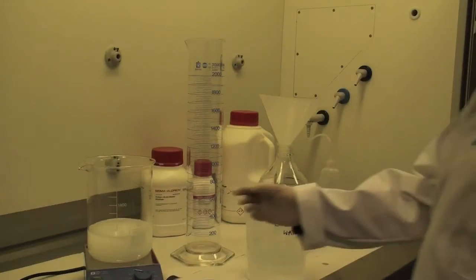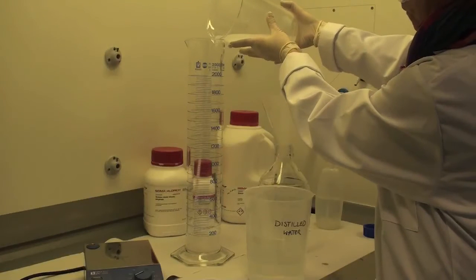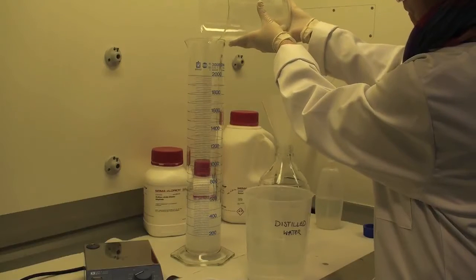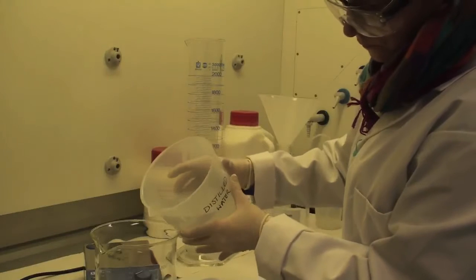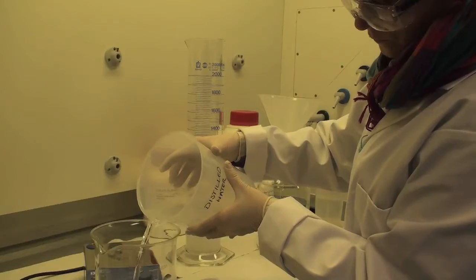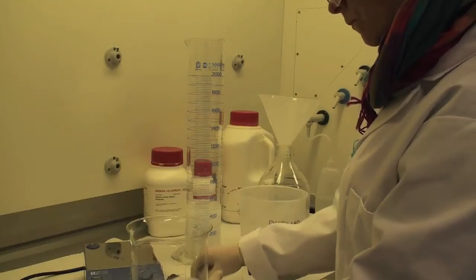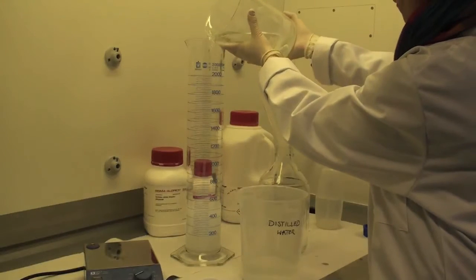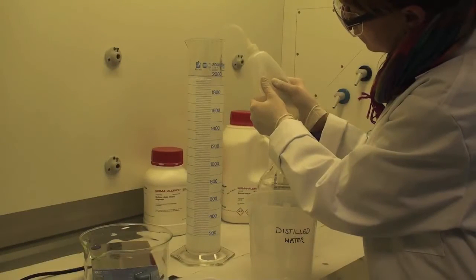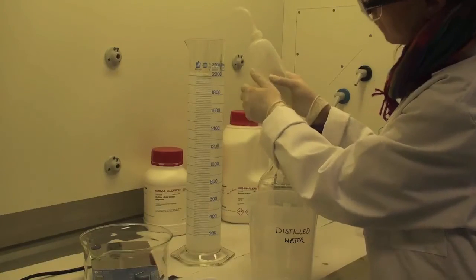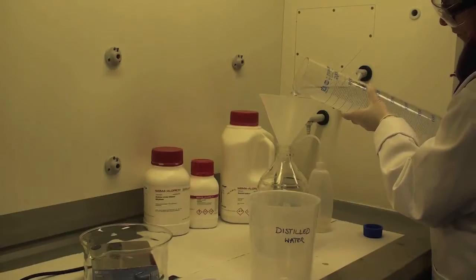Transfer this solution to a 2 liter measuring cylinder. Wash out the beaker with distilled water and then adjust the volume to 2 liters with distilled water. Transfer this into a 2 liter duran bottle. The solution is stable at room temperature for approximately 2 years.